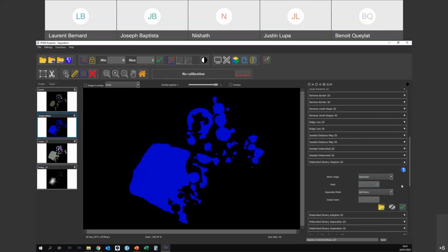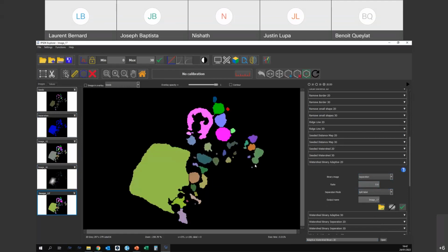So let's go on, for instance, put it in label just to be more visual, and you can see 0.5 maybe. Oh, it was too big, so okay, 0.6. So you can see that you can keep the U shape, you can cut the particles, and you can get this big particle not cut, extra separated.